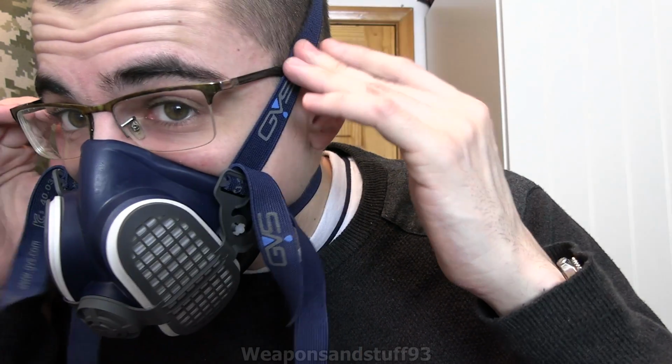That strap is tightened. So yeah, it seems to be pressurising. Yeah, that is pressurising. So there we go. Makes a good face seal. Now, my glasses work fine with it, because this nose cup is really good in that regard, because it does not interfere with glasses at all. But obviously if you wanted to, you could put your glasses over the ears as well. Let's just try that. There we go. Yeah, they work absolutely fine that way. So yeah, very good mask for not interfering with the glasses.